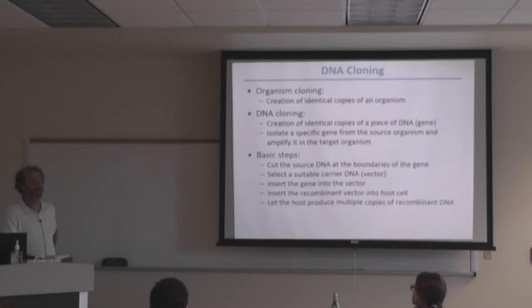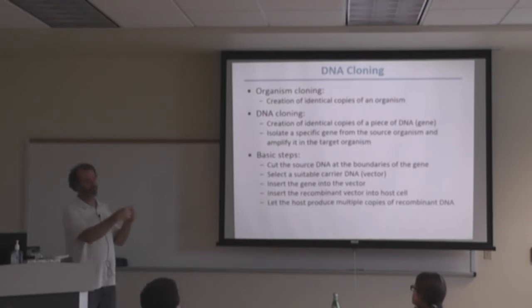EcoRI is an enzyme. No, it's the plasmid backbone. Remember you inserted it as the P-GAP? The P stands for plasmid. So it's the P-GAP vector for Methods 2. And you inserted the GAPDH gene that you copied via PCR.